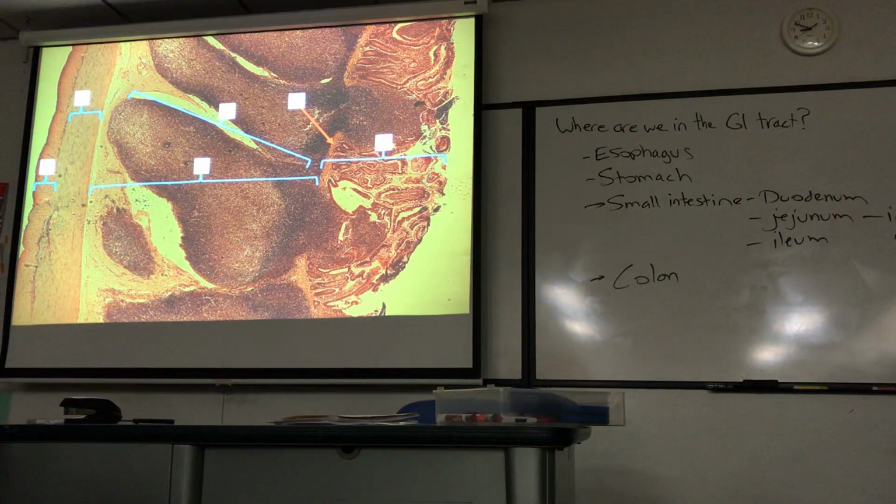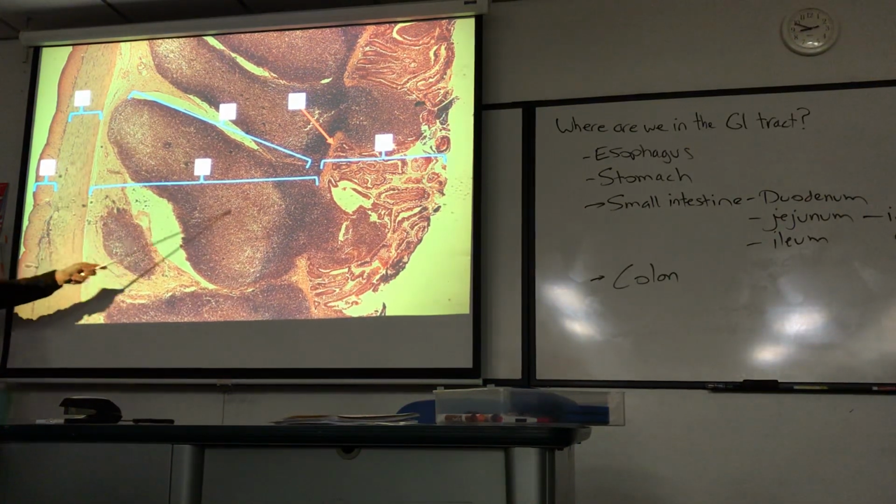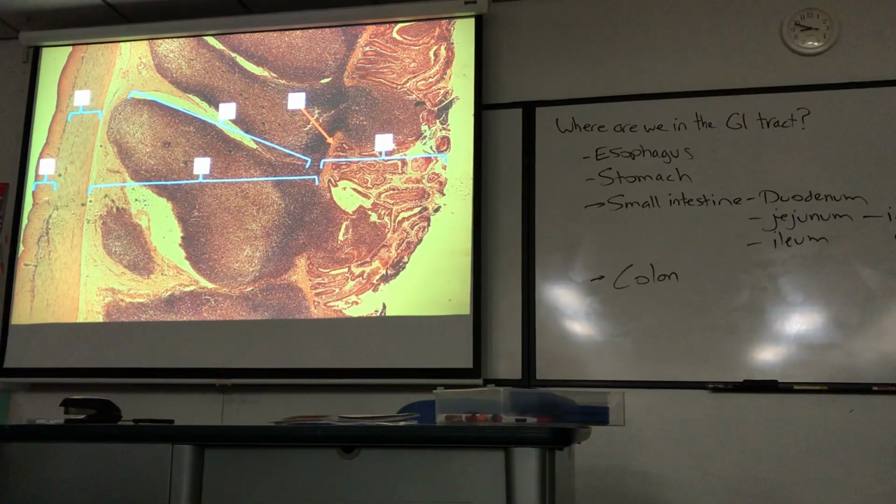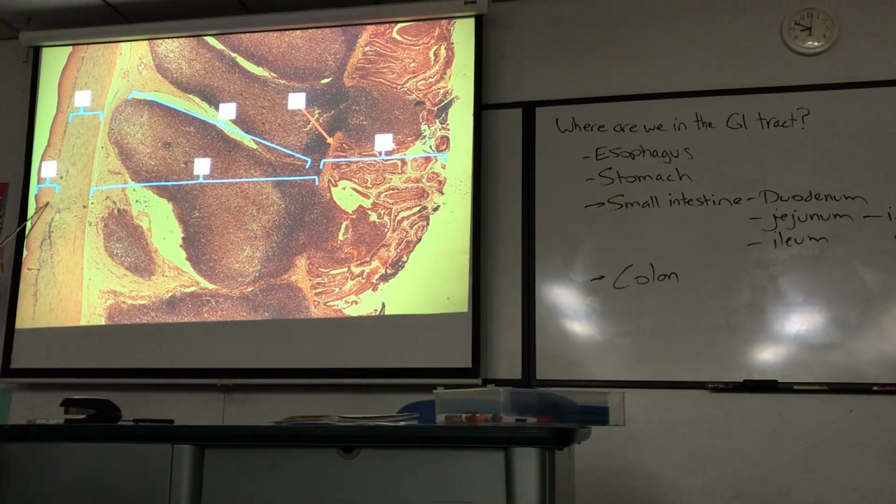This is ileum, and number 4 is ileal MALT, M-A-L-T, the mucosa-associated lymphoid tissue. And so MALT's huge, and it's a can't miss, and this is how you know you're looking at the ileum. Okay, so that's your clue. MALT, that's ileum. So the layers, 1 and 2, we start with the muscularis externa. Serosa, I guess it got sloughed off in tissue preparation.